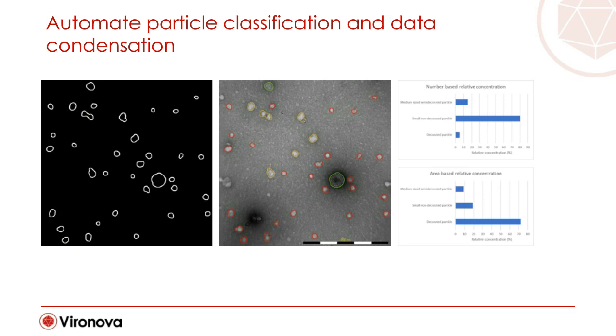When this analysis is done, we can produce high-performance fast and fixed features which generalize these findings. For instance, we pinpointed the surrounding band around the particles, and in these regions we can find the protein structures that separate what in these images are believed to be exosomes from influenza VLPs. With the different classifications in the middle image, green for VLPs, red for the exosomes, and yellow for something in between.